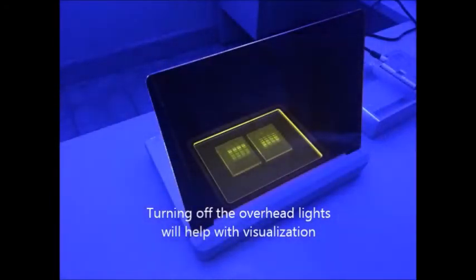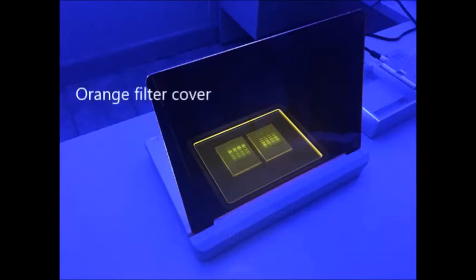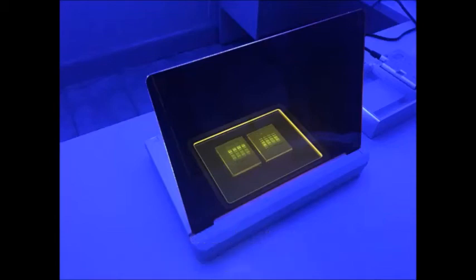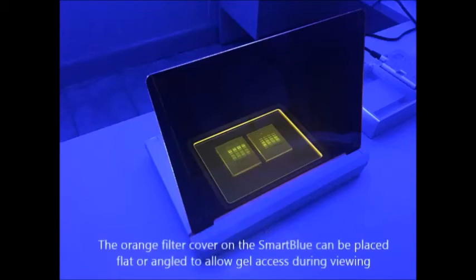The blue light excites the Smart Glow stain that has been attached to the DNA molecules. The orange filter cover on the illuminator blocks the blue light and allows us to clearly view the fluorescing DNA bands. The orange cover can be placed flat on top of the viewing surface or angled to allow access to the gels.